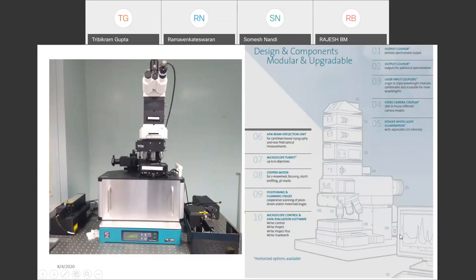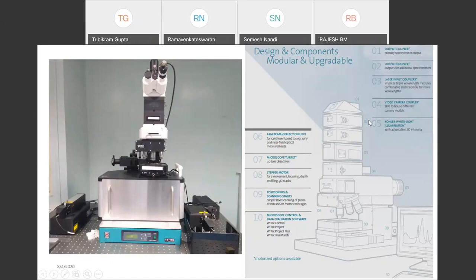Let's look at the instrument we have in our laboratory — this is the confocal Raman spectrometer. On the left-hand side image we can see the optical microscope, with two lasers adjacent to it and the spectrometer connected behind. On the right-hand side: number one is where you take the optical fibers going towards the spectrometer; number two is the output for additional spectrometers; number three is the laser input couplers — we have two, one at 532 nanometer and another at 365 nanometer wavelength, which can be coupled to the microscope.